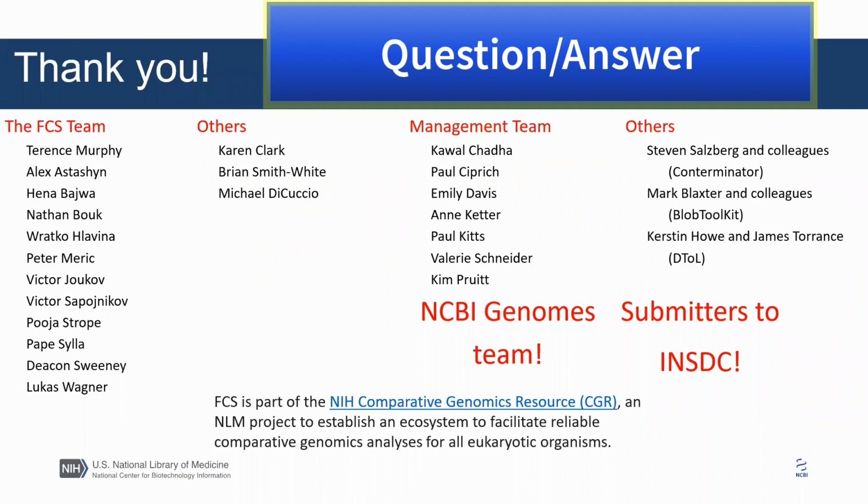I also mentioned that we want to make this publicly available to be consistent with the process that NCBI is currently using to screen incoming submissions for contamination. Right, so we're using it mainly on assemblies, and that's why we have it that way.